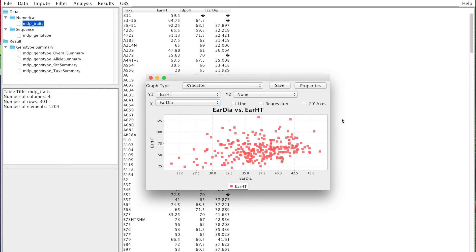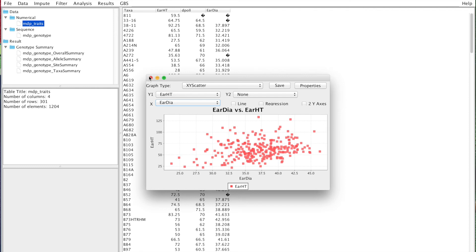We see there's some correlation - it's maybe not meaningful - but it's important for you to know these options are available. You can use that to filter data. Maybe you know your two data points are going to be highly correlated and you'll have an outlier. You take note of that, see where it lives, and down the road do the filtering.